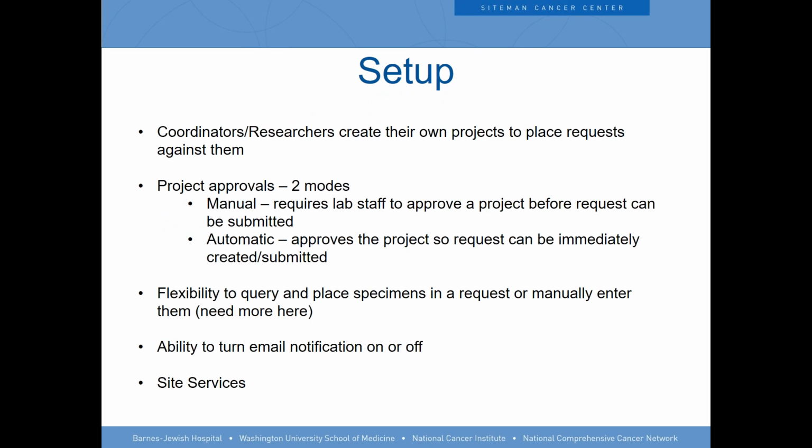So here's an example of what that looks like. And again, I know it's a poor screenshot and it doesn't show up very well in PowerPoint, but this is an extension of our request form. We have very specific things, and we worked with the tissue procurement core to design this. Now, again, you don't need to be a programmer. You don't need any kind of special skills to do this stuff. It's pretty straightforward.